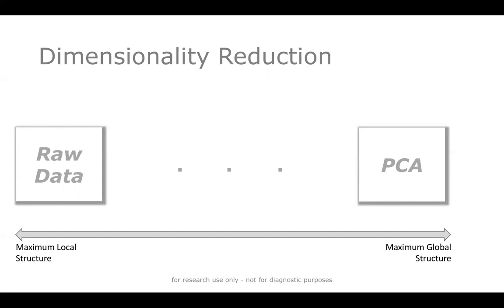embedding. And so anywhere in between those two different milieus, you can find nonlinear dimensionality reduction. And this is going to include things that we know already, like T-SNE and UMAP. But we've now added a new dimensionality reduction embedding, which is called TriMap. And TriMap tries to do a better job of retaining that global structure that we get from principal component analysis, so that overarching relatedness between clusters within the embedded space. So how does TriMap look? How does it compare with T-SNE? Well, let's take a closer look.